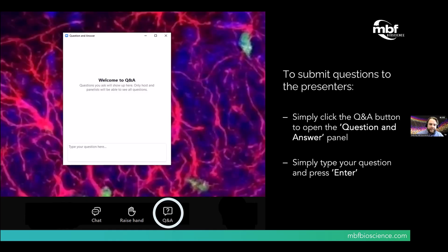One question was about how many fields of view it typically takes to acquire a mouse brain. We do have the 10x detection objective. With that objective, it really depends on the size of the sample and the clearing technique that's being used. With the clearing, there can be slight expansion or shrinkage to the sample. But somewhere between 8 and 9 imaging tiles over the course of maybe 1,000 to 1,500 Z planes through the volume for a 10x objective. For a 5x, it's typically around 5 to 6 tiles with the same Z sampling.